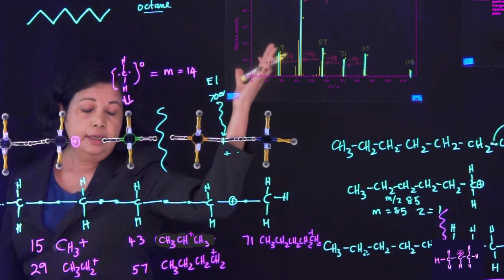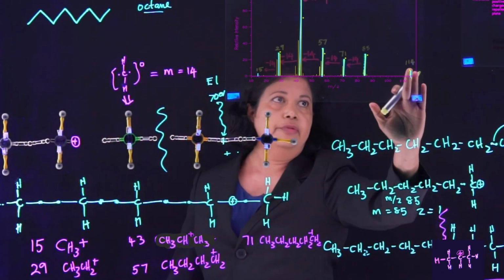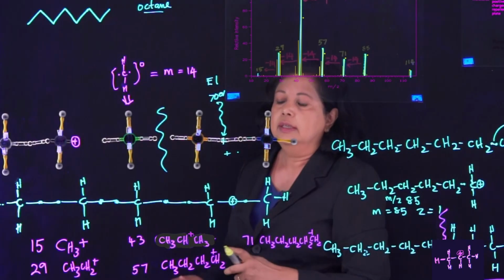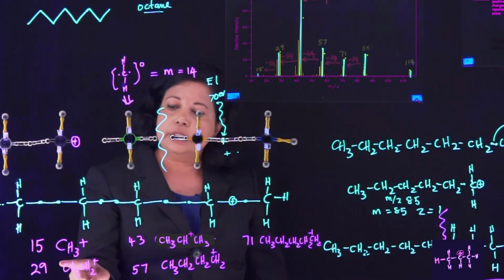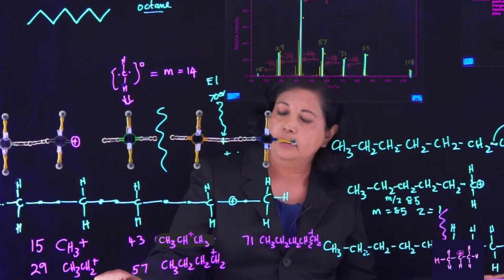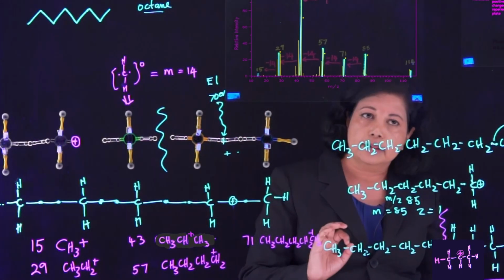Obviously, if you put, let's say, heptane or hexane, then your peaks are going to be different because your molecular ion peak is shifted. However, in alkyl spectra, if you have a pure alkane, you are bound to see these peaks. If you see a 29 peak in an alkane, or in something that has an alkane chain, it's typically going to be an ethyl cation.